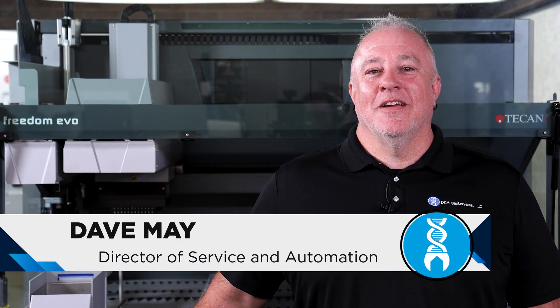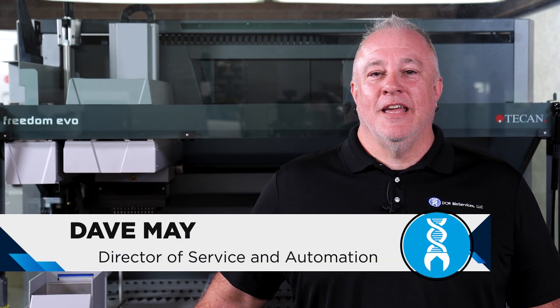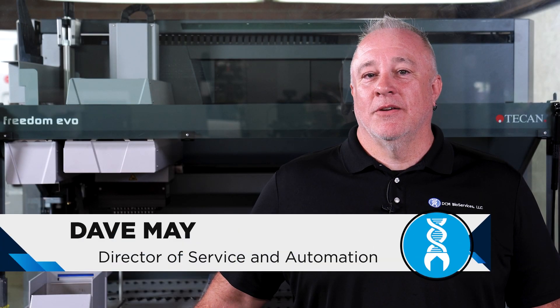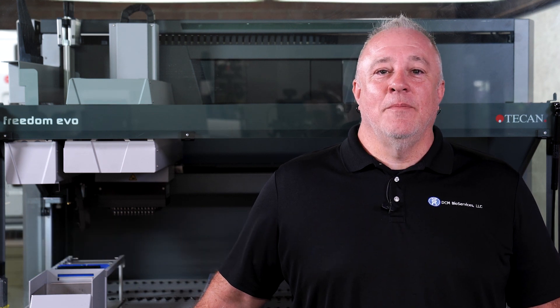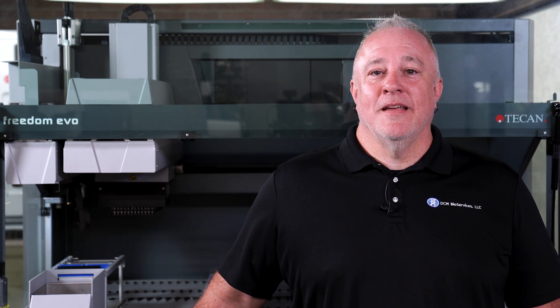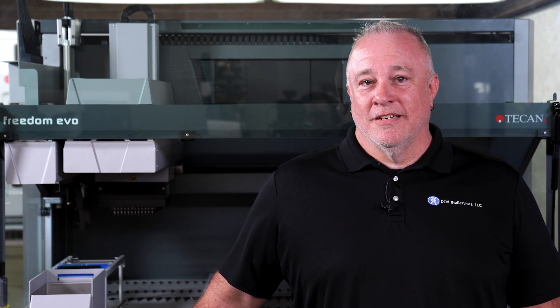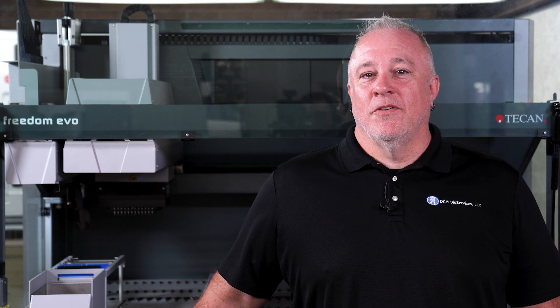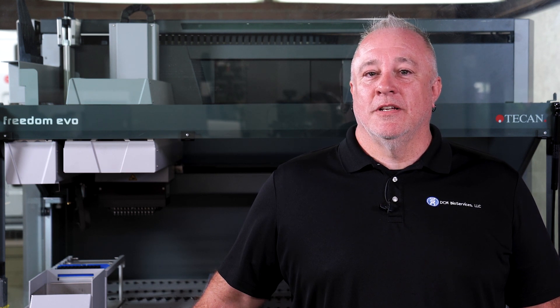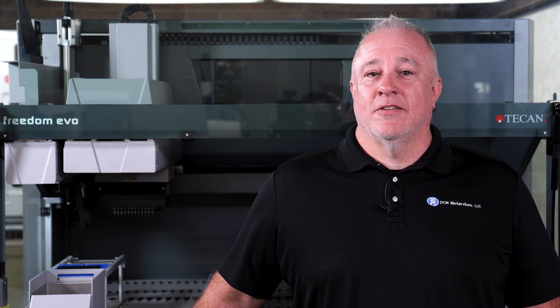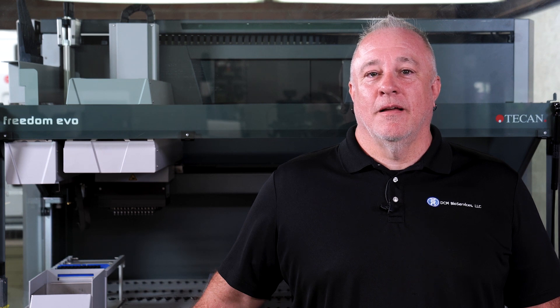Today I'll be teaching you how to create a simple transfer method for the T-CAN Evo series liquid handlers using the 8-channel head. I'm Dave May with DCM Bioservices, and as always, if you don't feel comfortable performing these steps on your own instrument, reach out to us today at service at dcmbio.com.